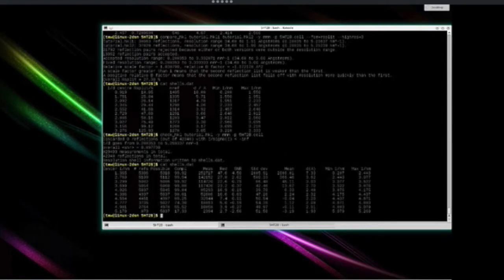So in the last few minutes, if you read up on free electron laser data processing, at the moment you'll read a lot about partialities and post-refinement and new ways of merging the data that are better than just a straight average, which is what process-hkl is doing. Those algorithms are implemented in CrystFEL in a tool called partialator, and using this is really easy. In fact, simply run partialator -i tutorial.cell.stream. Again, -o output.hkl, symmetry, mmm. So far it's exactly the same as we had for process-hkl. It's just that the name has changed to partialator.